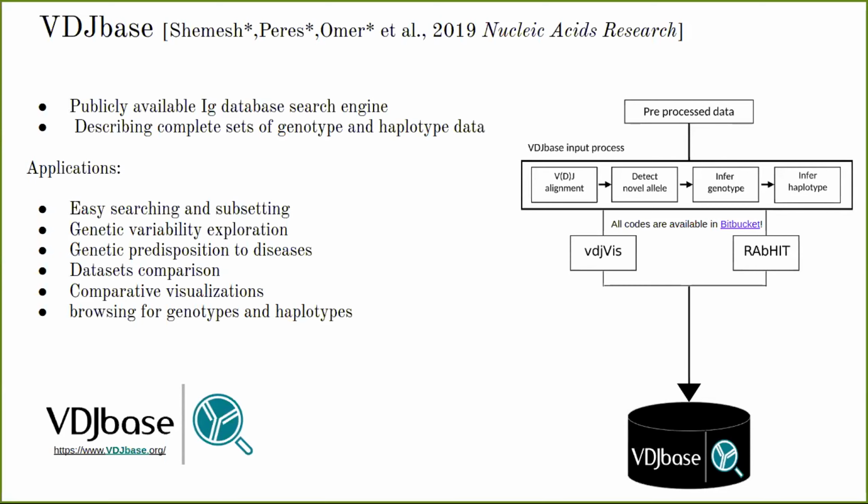So in order to be able to compare different samples, we have developed a uniform pre-processing pipeline that all the samples must pass before entering VDJbase. In addition, for easy comparative data visualization, we developed two R packages, VDJ Viz and RAbHIT. All of these tools are the basis for VDJbase, and all codes are available in Bitbucket.